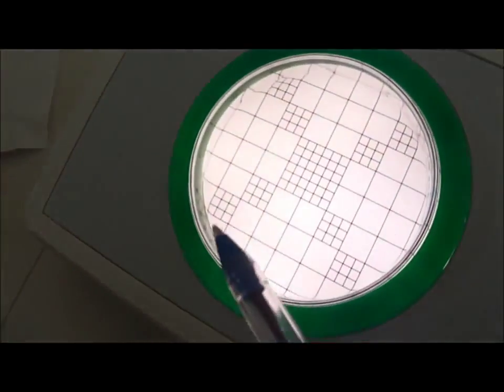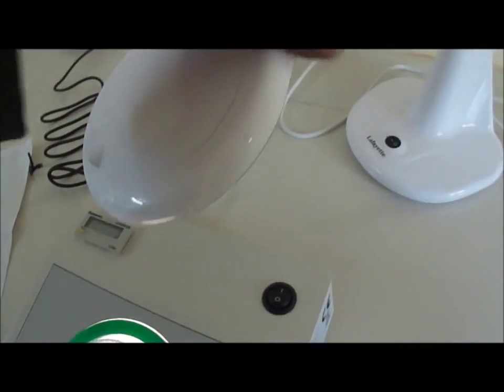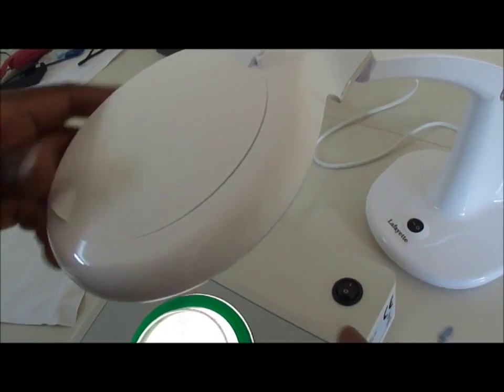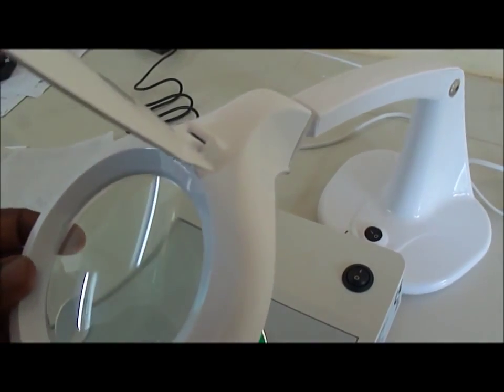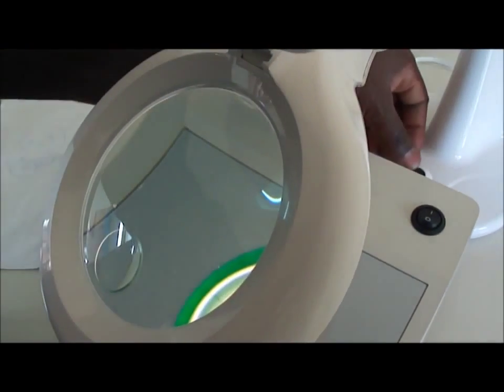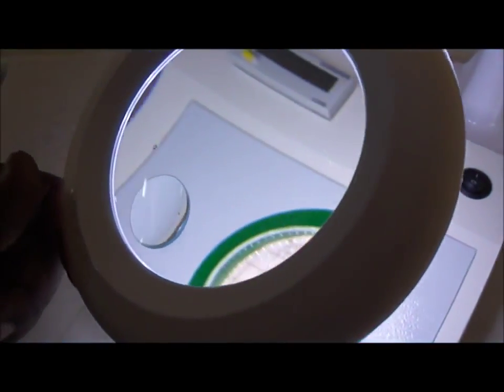Now sometimes, even with that, the number of groups or colonies is so large that you cannot easily count them with your eyes. Then you use this device, that's a magnifying device. The model we have here is this one. You connect it, it has an electrical connection also. You bring the magnifying glass in front of your plate, and if the light is not enough, you can light it up.